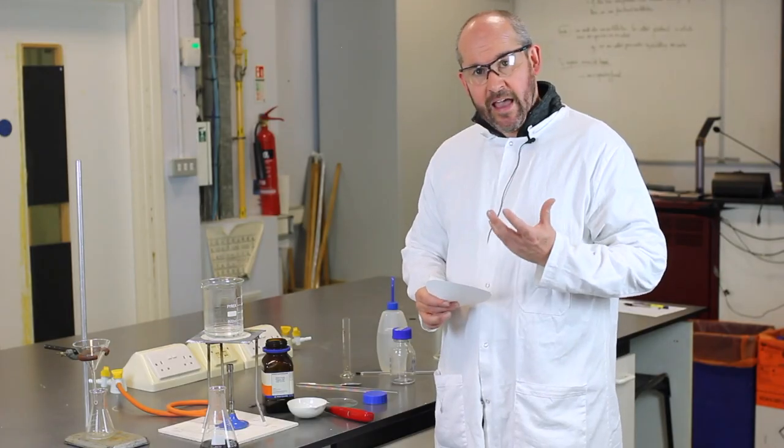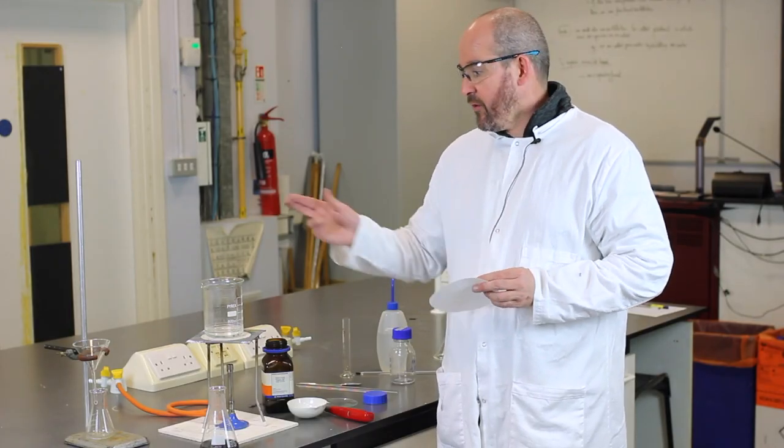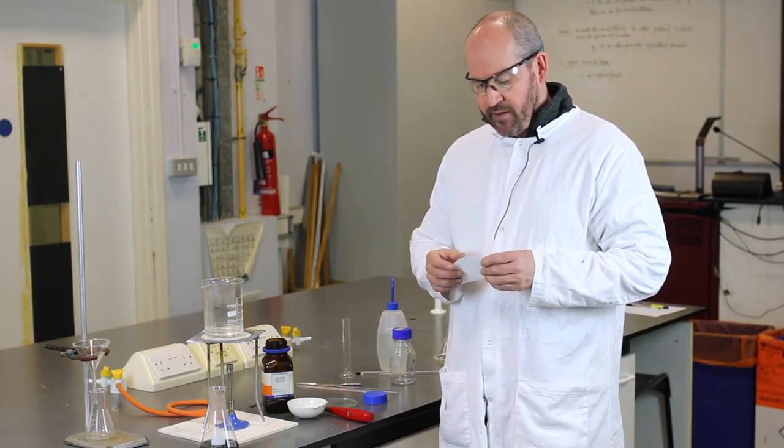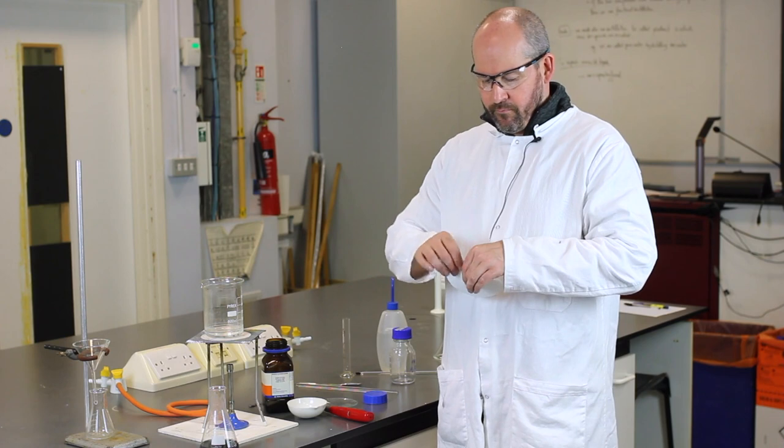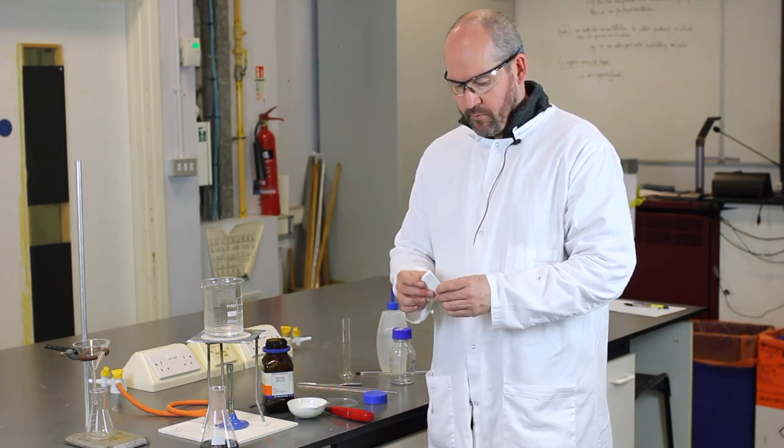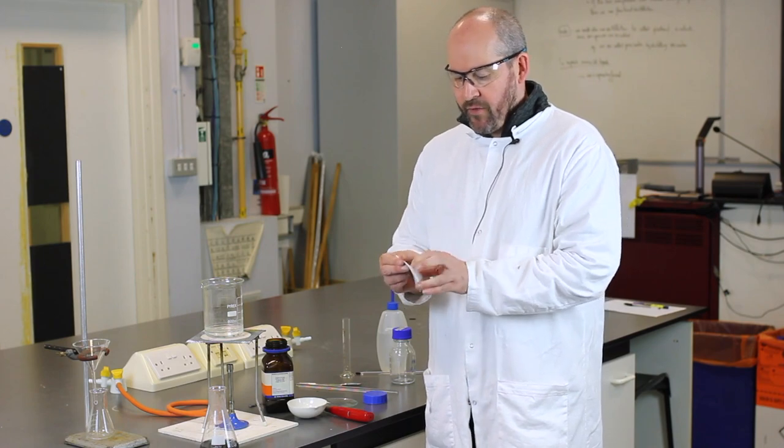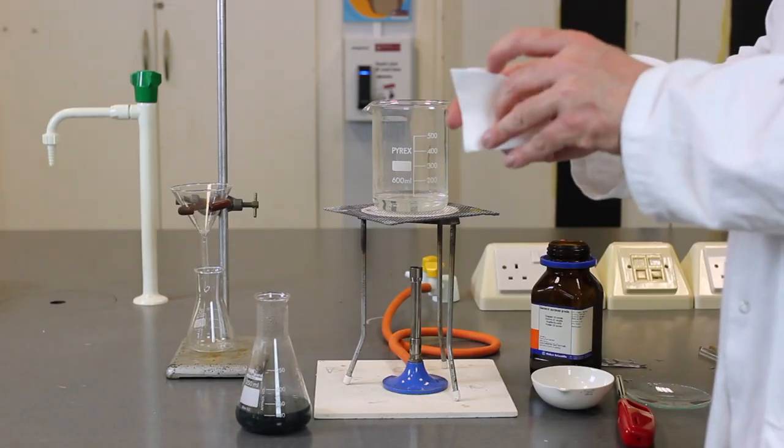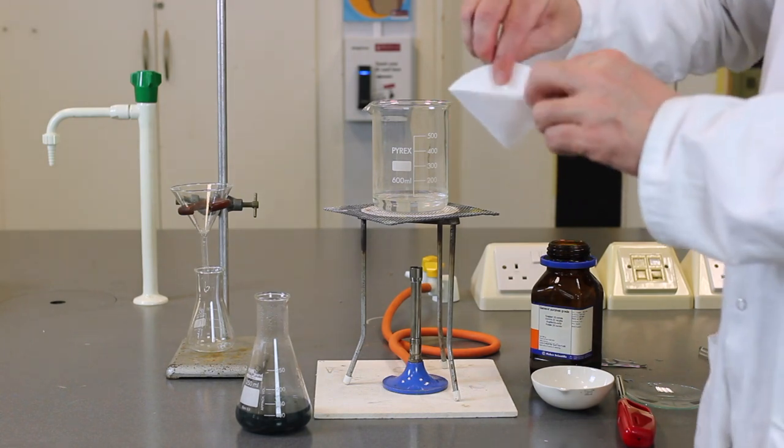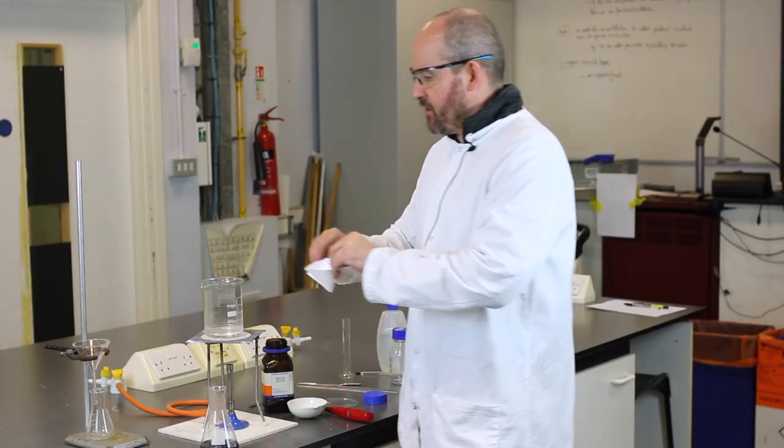So we're going to filter off the excess copper oxide using a funnel and the filter paper. So the first thing we do is we fold the filter paper into four, like so. And then we've got to form a cone of that type, like that. Then we open one of the leaves of the cone. So it looks something like this. We place it in the funnel.